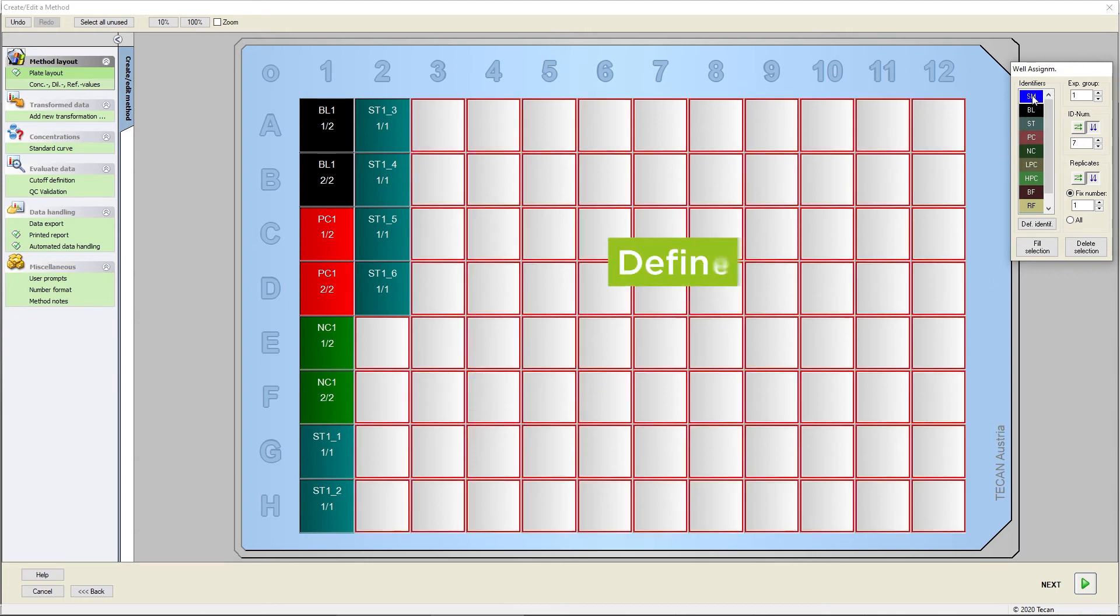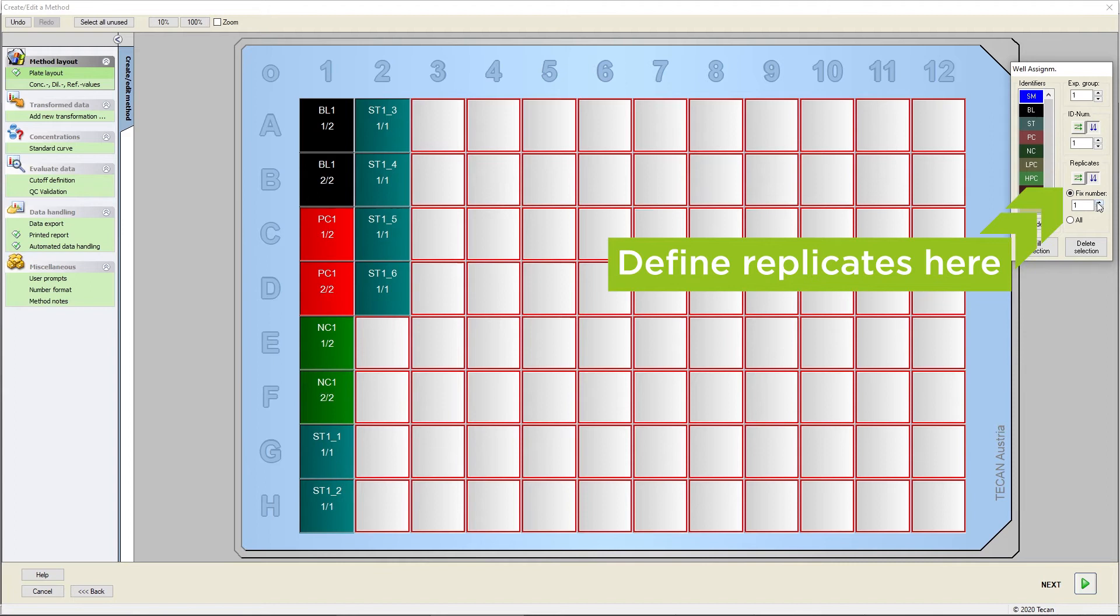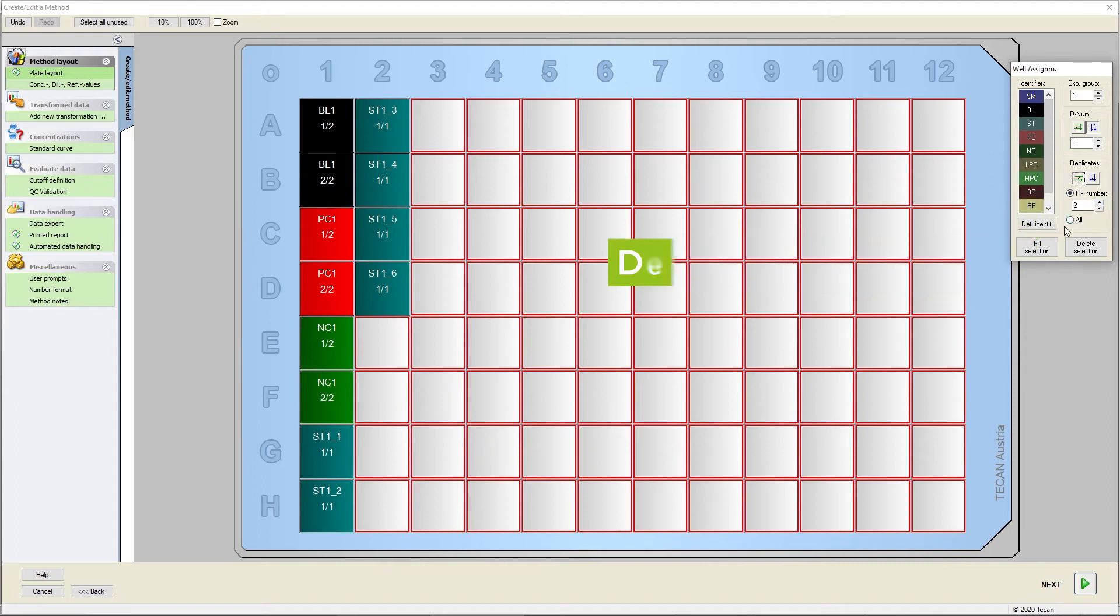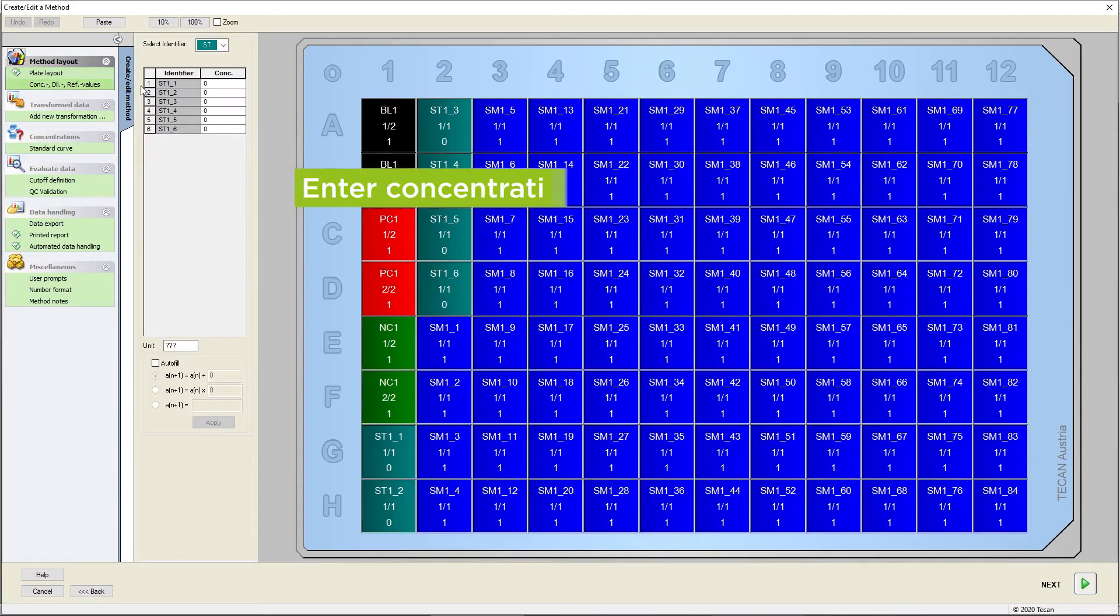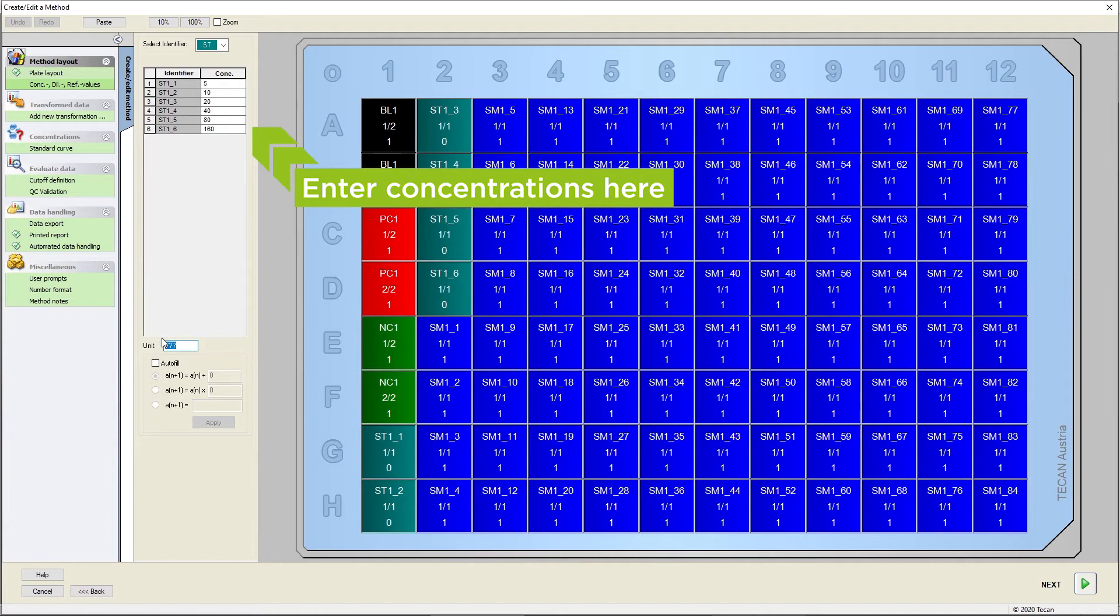Depending on your needs, you can also define all liquids in replicates in the horizontal or vertical direction. To enable concentration calculations, type in or paste the concentrations of your standards and the relevant unit here.